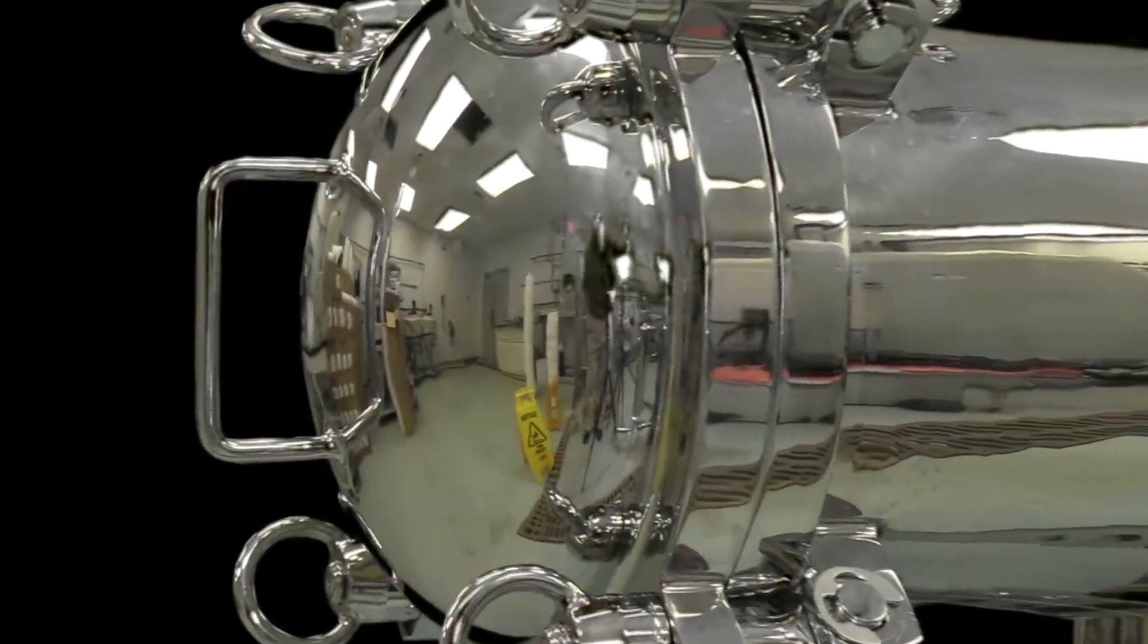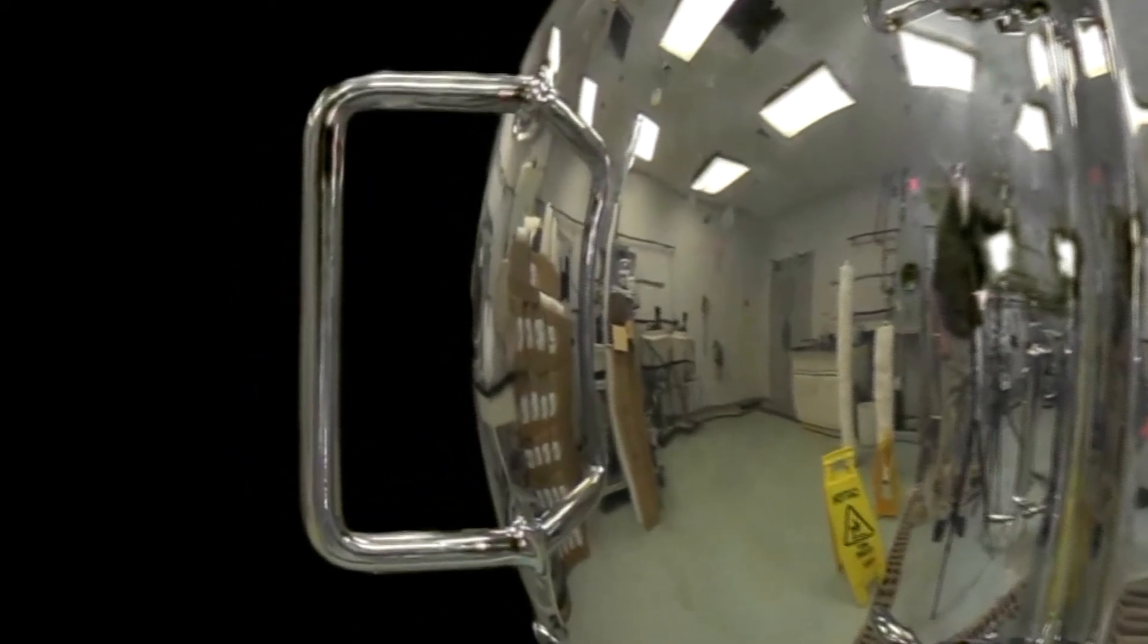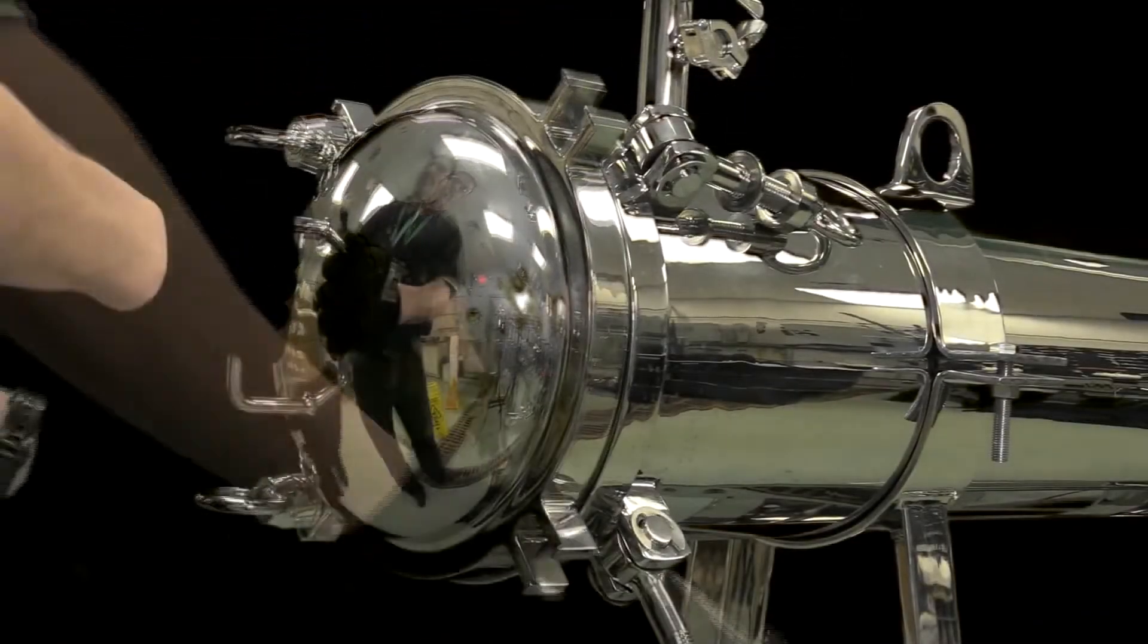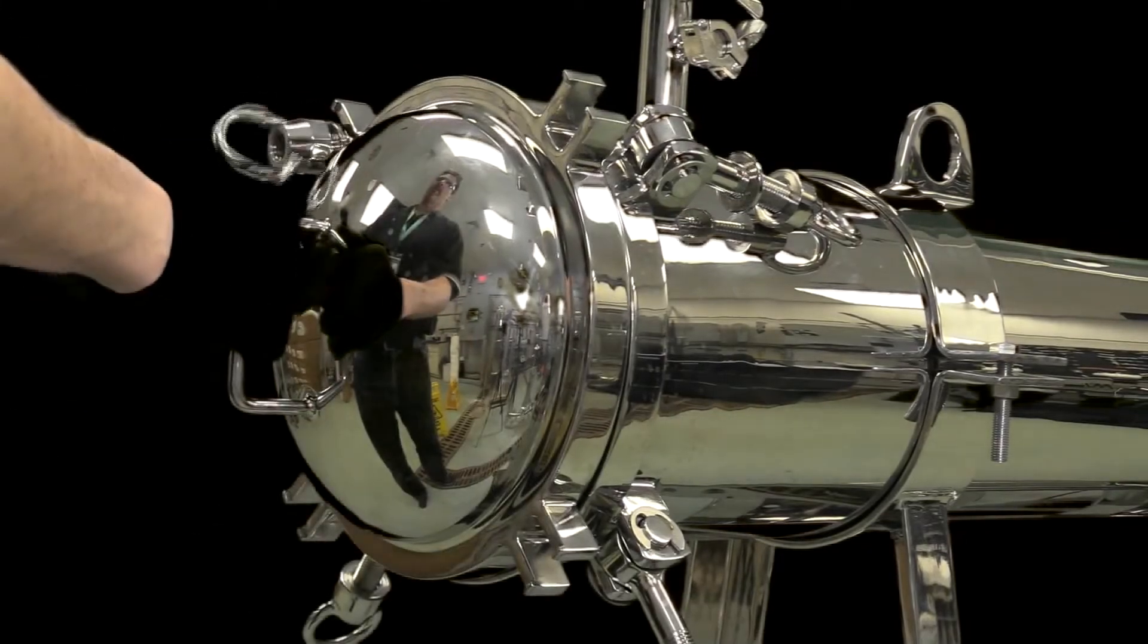First, identify the housing end with the handle attached. Loosen the four clamps on the housing lid. Swing open the housing lid.